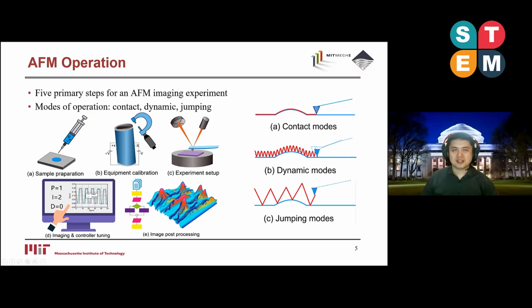The third one we call the jumping modes. There are different names for this one, but in this case, the probe tip and the sample make intermittent contact, and the resonance of the cantilever is not excited. This mode is suitable for quickly covering a larger imaging range because it does not have to ensure very good tracking between adjacent points of contact. You can jump from one point to another, which has a large distance between them, and then get the sample measured at those pixel locations.